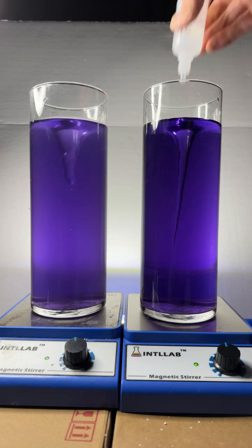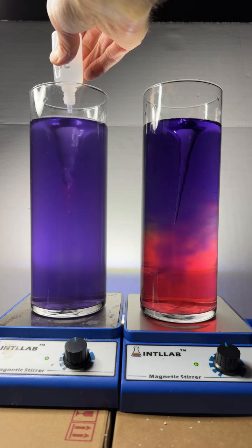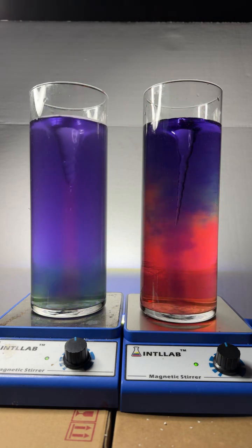Now we're going to go ahead and add some acid to both, so I'm going to add one, two, three, four, five drops of acid to both. And now you see the shift to red.